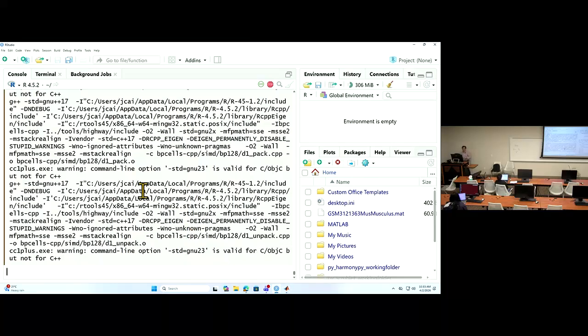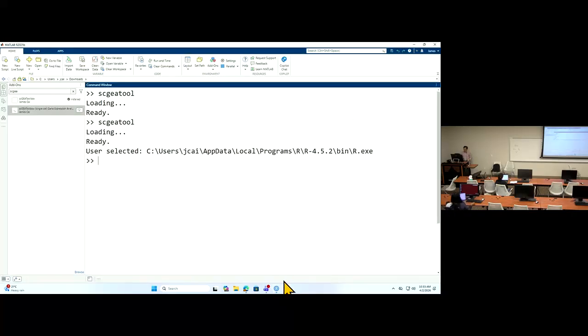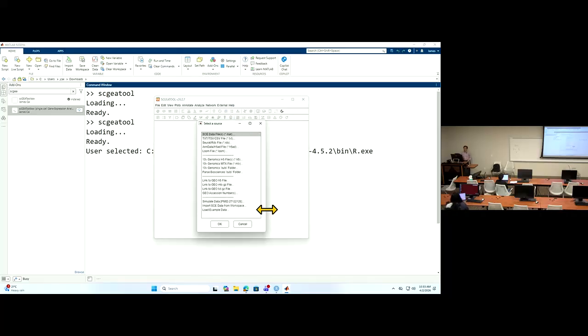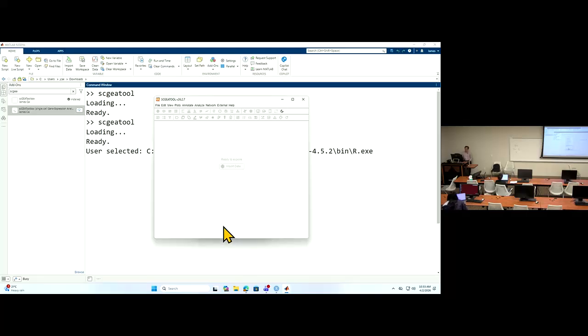Okay, so I will just let this installation run in the background. Here I want to show you, I'm going to simulate some cells. By default I will simulate 3,000 genes in 5,000 cells.